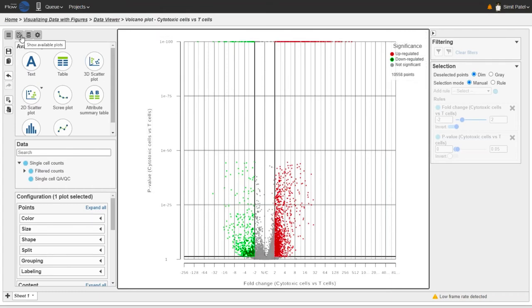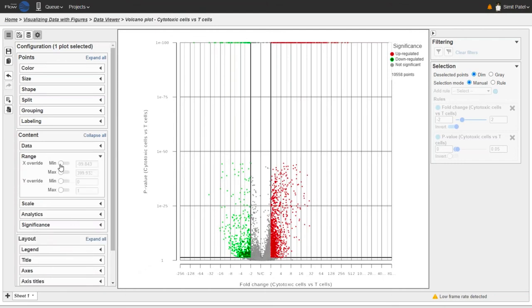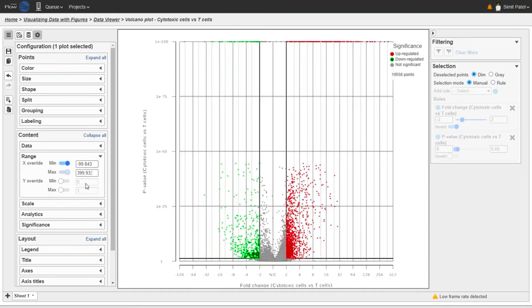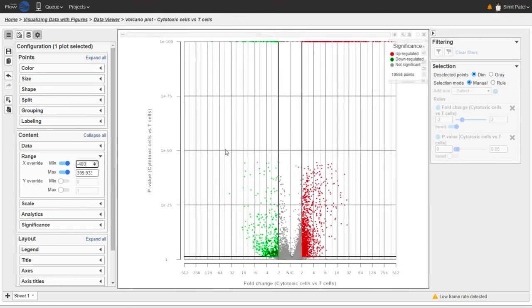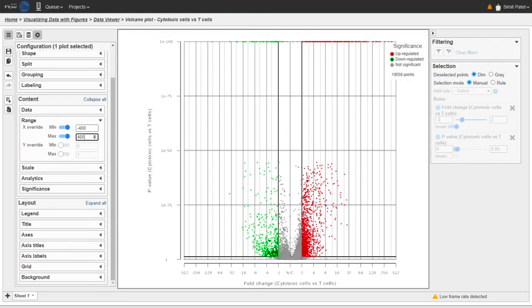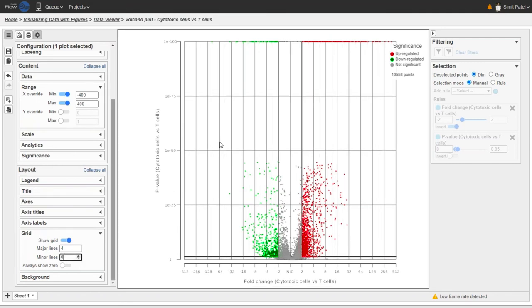I'm going to use the panel on the left to configure the plots to better see the pattern. I'll start by making the x-axis more symmetrical — changing the range by overriding the minimum and maximum values to roughly equal values. I'm going to set that to minus 400 and plus 400. That's a bit more symmetrical now. I can also get rid of some grid lines — I'll remove the minor grid lines by opening the Grid card, which looks a bit cleaner.